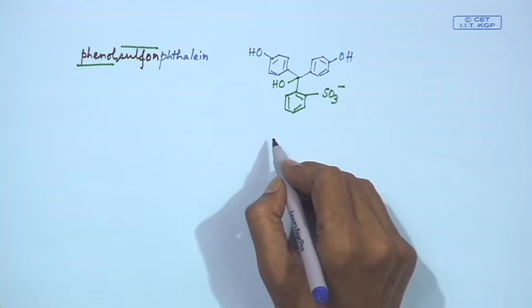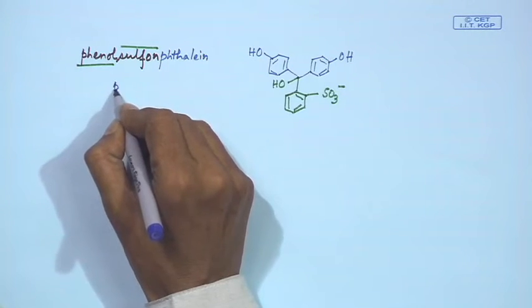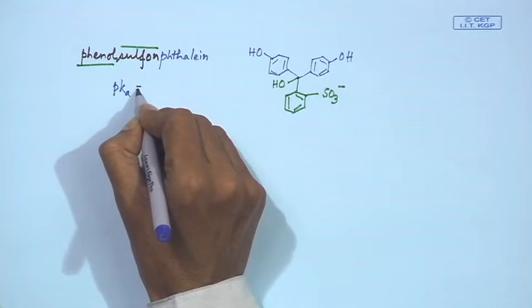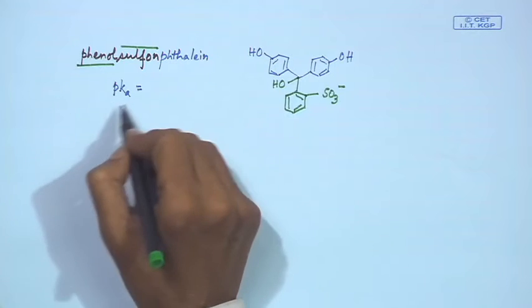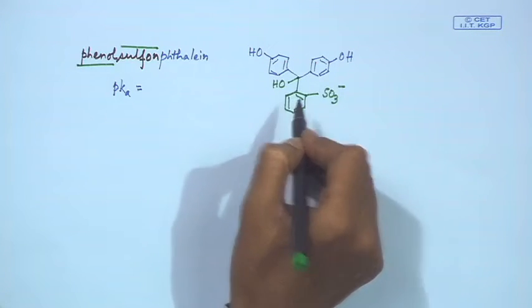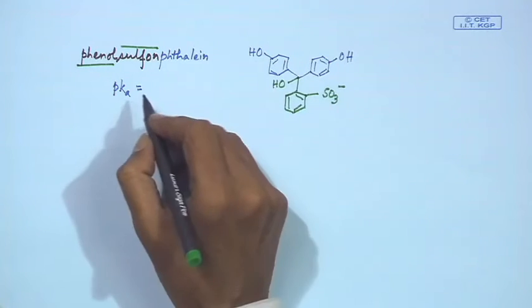The pH range for the color change is related to the pK value, which can also be determined experimentally by knowing the concentrations at different buffered pH values of the medium.